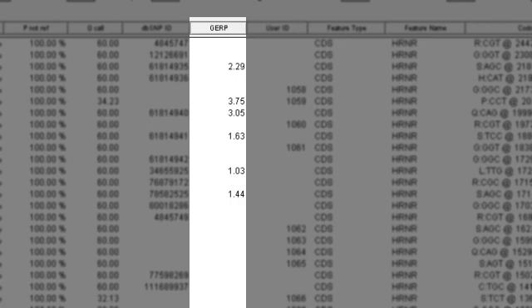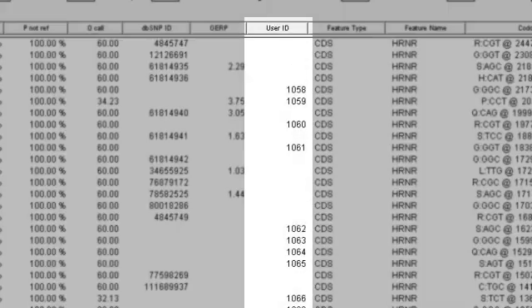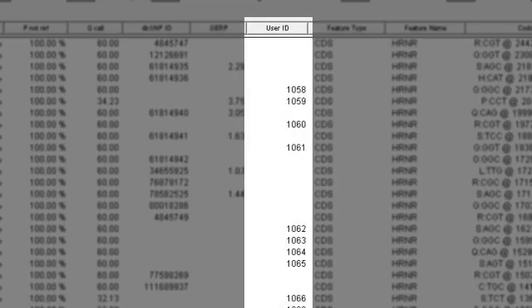with higher scores meaning a more conserved base. The user ID shows SNPs that were annotated in SeqMan Pro in a previous assembly and then saved to the genome template package.